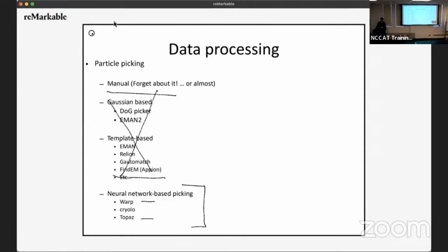And how would I do it? So basically, if I manually pick, I miss a lot of the orientations. How would I start off with manual picking and then evolve the neural network to get everything? What would be the best? Well, one option is you let the neural network do its thing, and you see everywhere where it's wrong, and you correct for that.